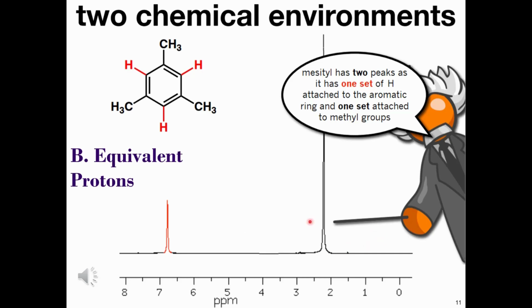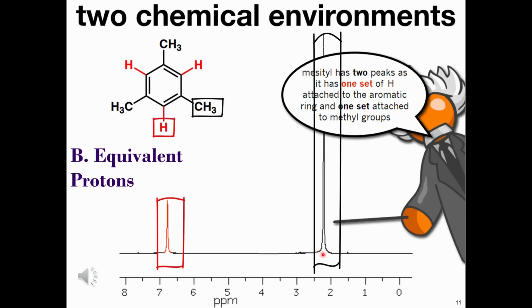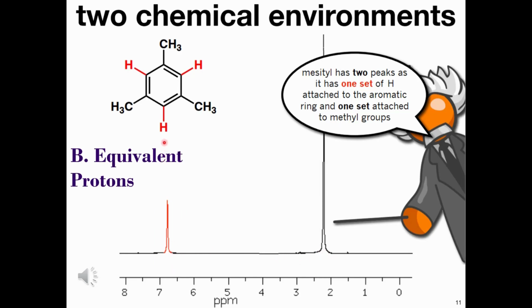Benzene's electron withdrawing effect is very strong, thus this effect is transmitted to those protons attached in the 3 CH3 groups of mesitylene. Notice how 2 unique chemical environments produce only 2 proton signals. Let's increase the number of environments one more time and use a molecule with a little less symmetry.